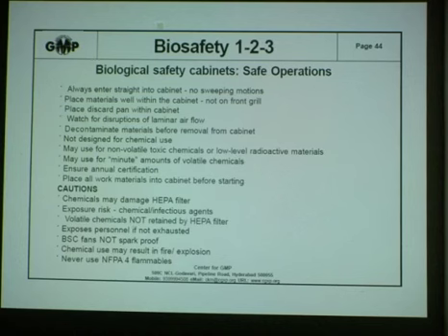Here are some more tips for biosafety cabinet safe operations. Always enter straight into the cabinet. Don't make sweeping motions inside the work surface. Place materials well within the cabinet, not near the front grill. Place the discard pan within the cabinet. Watch for disruptions of laminar airflow. Decontaminate materials before removal from the cabinet.